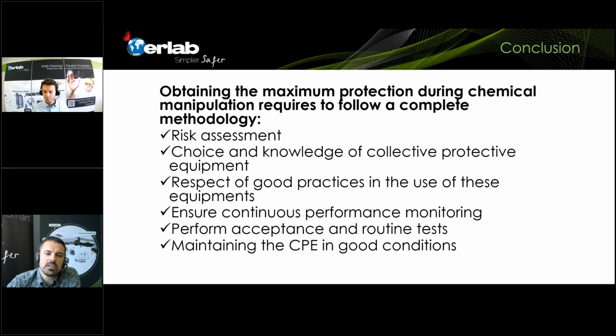Oh, thank you. Joseph, just another information, because you asked the type of device we use. This is an electrochemical sensor with three threshold values that we use. And if you wish to have more information, do not hesitate to contact us and we will give you all the technical details you may need. So Eddie could just confirm that it was okay, your answer. So thank you, Eddie, for confirming.